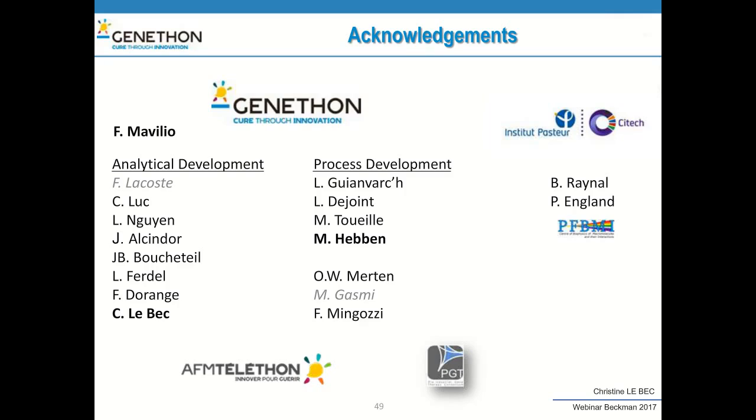Thank you. You perform AUC technology as a routine test to monitor the quality of the AAV vector. Do you plan to validate this method for quality control of cGMP lots as a release testing? Right now, we make some qualification of the method. As I presented, we made some repeatability tests just to demonstrate the repeatability and the linear range of the signal.